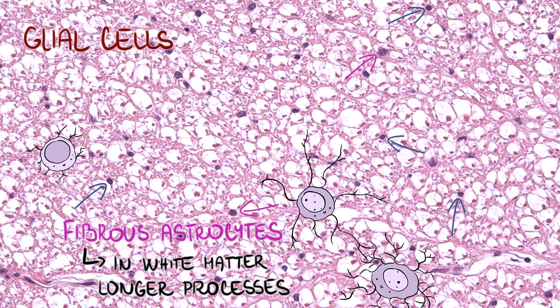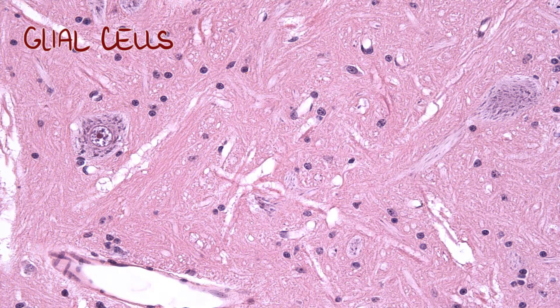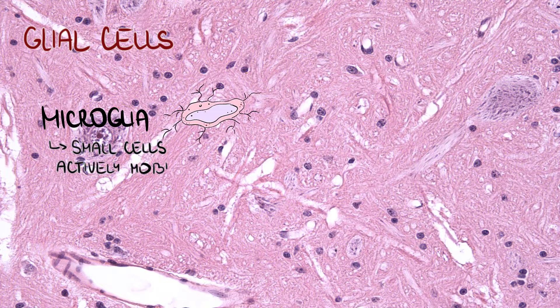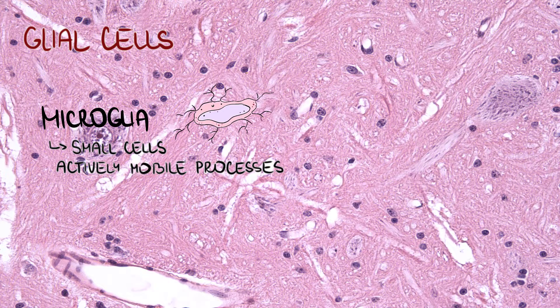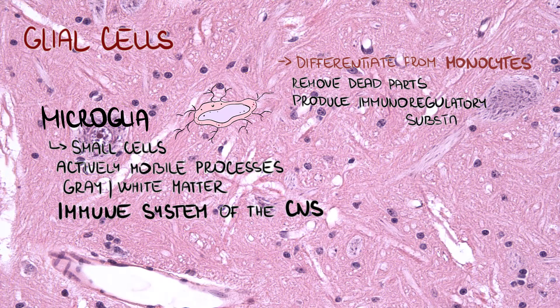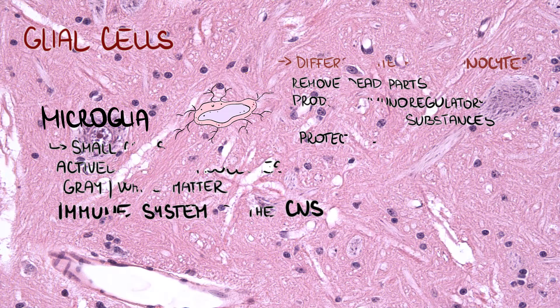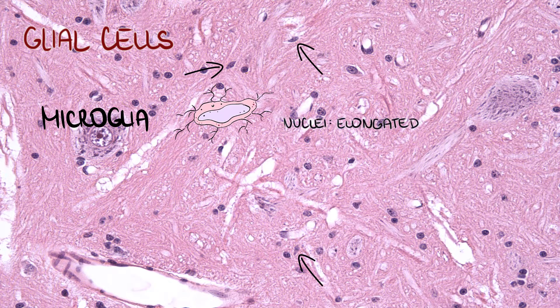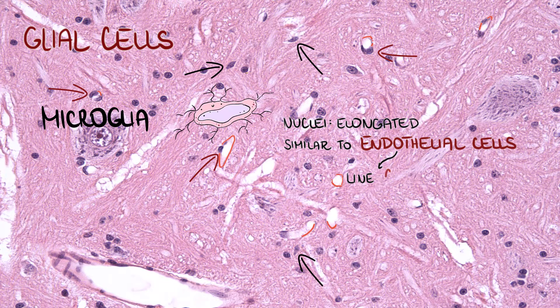Another type of glial cells are microglial cells. Microglia are small cells with actively mobile processes, evenly distributed throughout gray and white matter. Microglia are the immune system of the CNS — they differentiate from monocytes, just like macrophages in proper connective tissue. They remove dead parts of cells, produce immunoregulatory substances, and provide protection against harmful substances and bacteria. They have elongated nuclei and are very similar to endothelial cells, which line capillaries in the nervous system, so don't confuse these two.